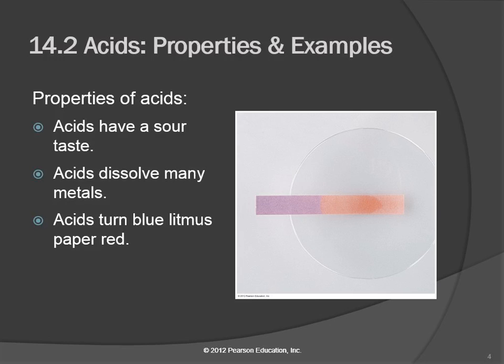It can be a little hard to see what we're exactly looking at here. This is the original color of the paper. Some of them are, this looks more lavender to me. This is a watch glass with some acid. When we put the blue litmus paper into the acid, the litmus paper turns pink. Or they say it's red, it looks pink. Litmus is a chemical that is sensitive to hydrogen ions, and so it'll turn pink or blue, depending.